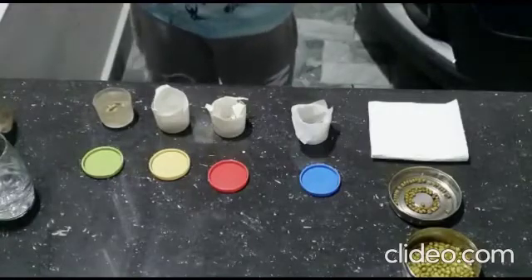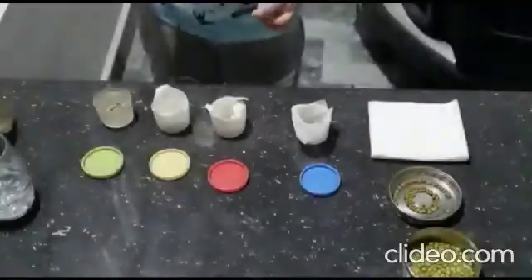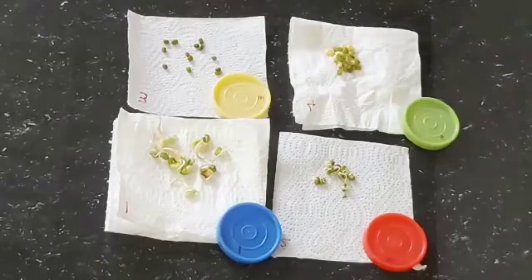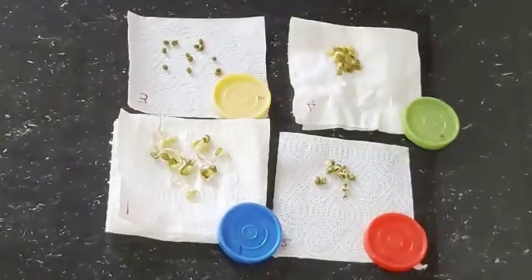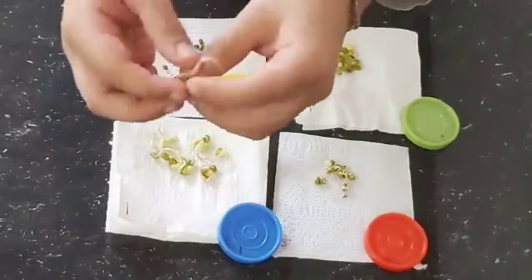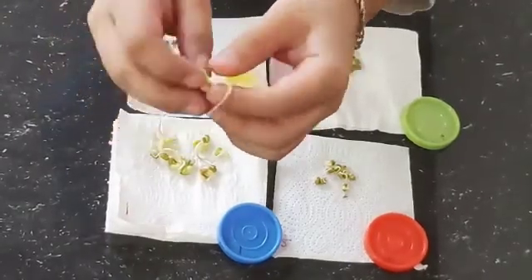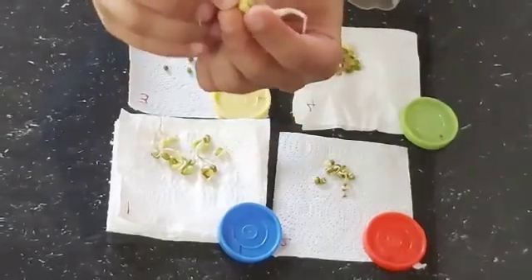Now we will see what will happen after 24 hours. So let us observe what has happened to our seeds. In the first cup, where the paper towel was wet and the seeds were pre-soaked, all germinated nicely — they have long radicles and the plumule is yet to come.